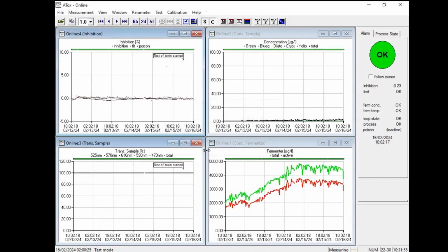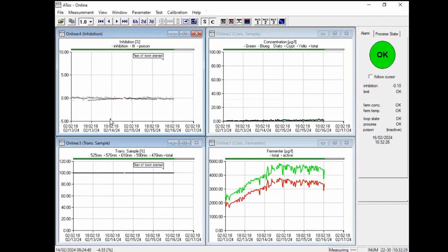And this will be kept in the database forever, as long as you don't delete it, but it's fixed to a certain timestamp that you have commented, something which occurred, which you surveyed, or when you proceeded with a test, or you said, oh, there was a tube bent, and that's because something was strange. You can comment it, and it will be put into the data.